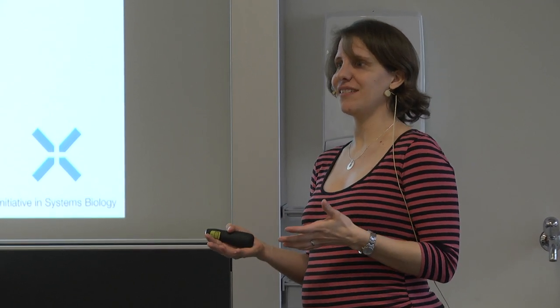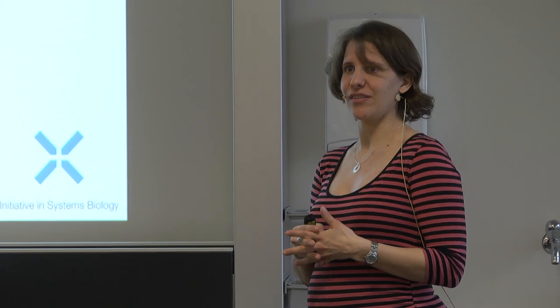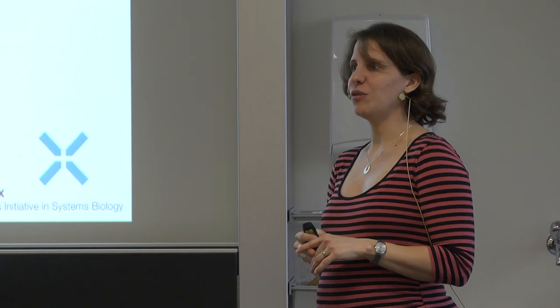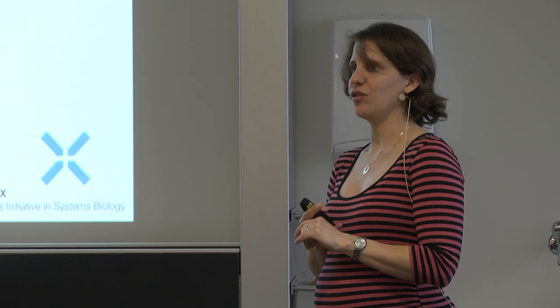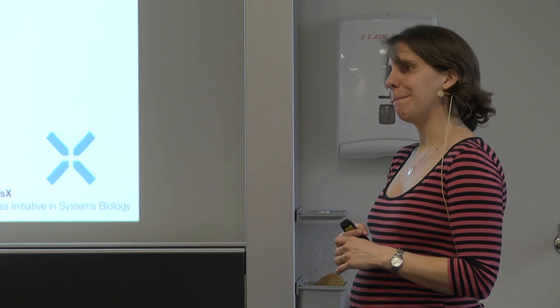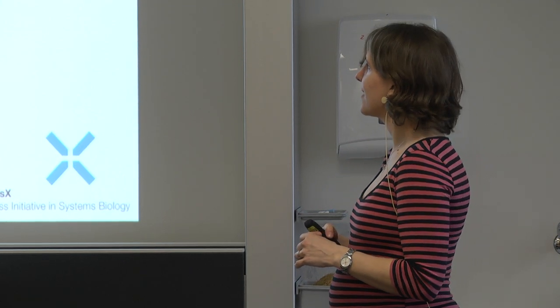But what we didn't touch at all was how to quantify, and actually that's the main reason we have learned to do targeted proteomics: to get improved quantification. So now we want to dedicate a whole hour just on this topic, how you can use your targeted proteomic data to get quantitative results.